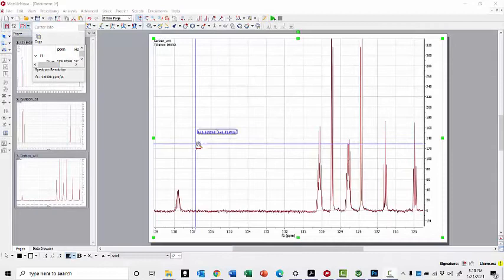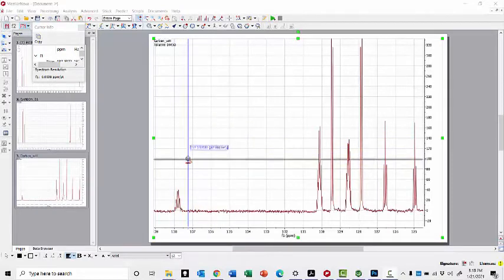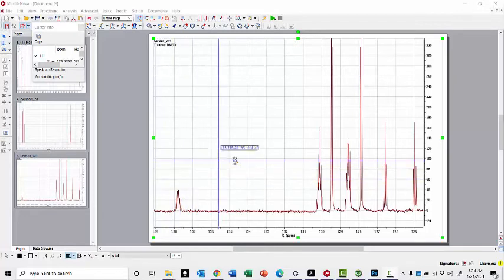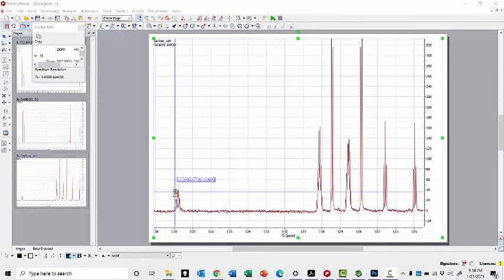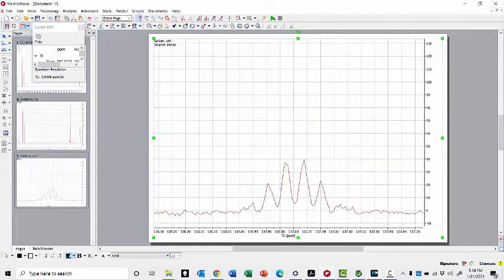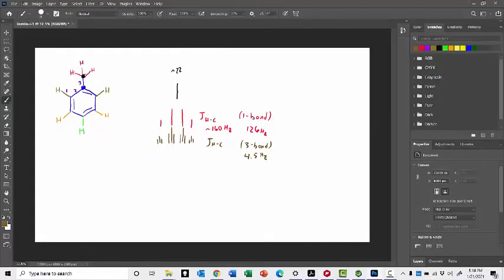Looking again at this spectrum, I now want to focus your attention on what is obviously the quaternary carbon, given how small it is, and the fact that it is not split into a large doublet. So if we look carefully at this, what you see is it's fairly complicated looking. So why is that? So now, of course, what we're looking at is the blue carbon. And I would simply like to draw your attention to the number of hydrogens nearby that can be said to be within, say, 3 bonds of it.